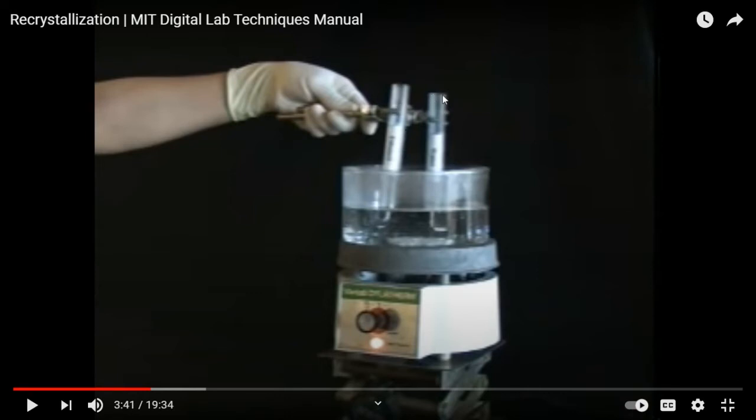This thing gets pretty hot because you are boiling things, and the vapor reaches up here where you're holding it. Vapor is going to escape, and if this touches your hand while you're holding, you're going to feel, oh, so hot, and you drop it.